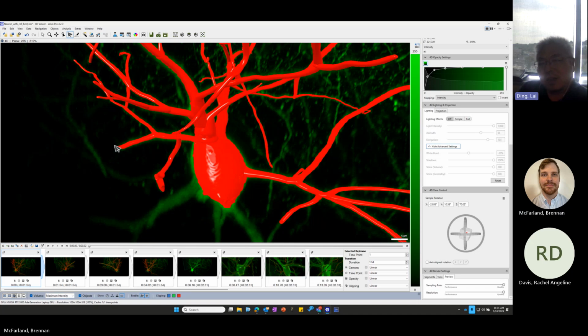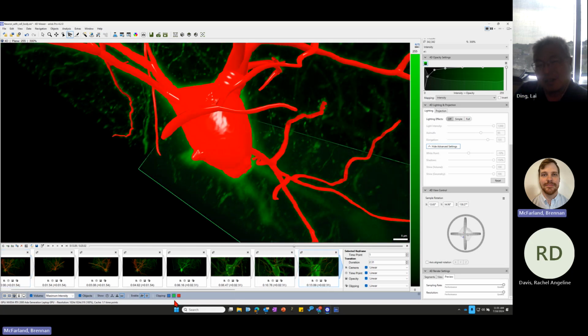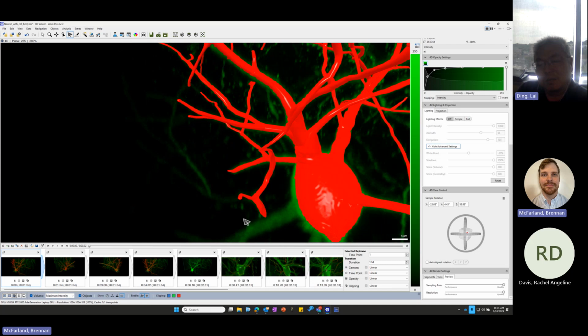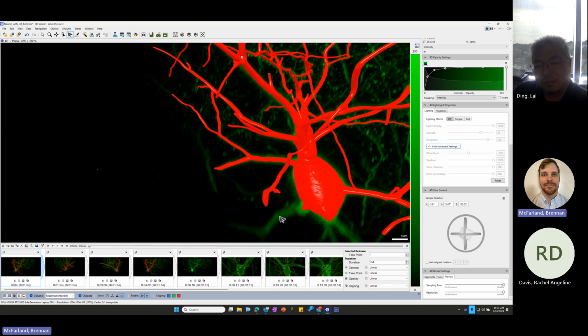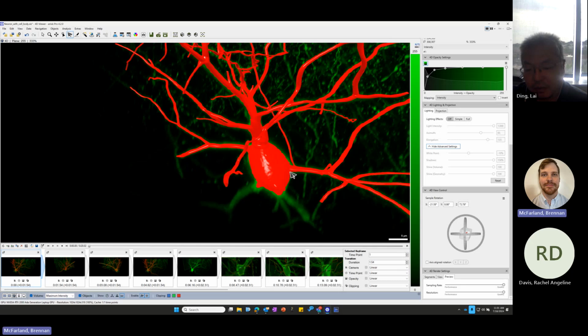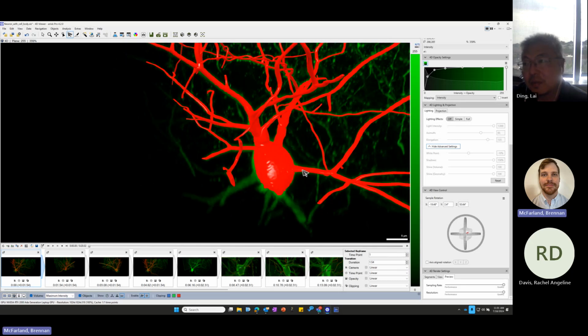My question is, can we do that without manually setting the keyframes? We would have to manually set the keyframes. Okay. I'll add it and just show you that we can do it, because it's going to interpolate the rest for us.